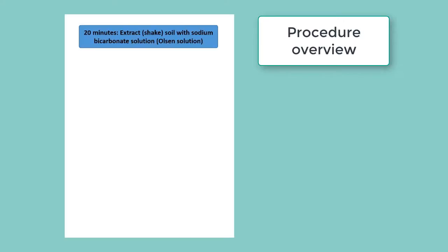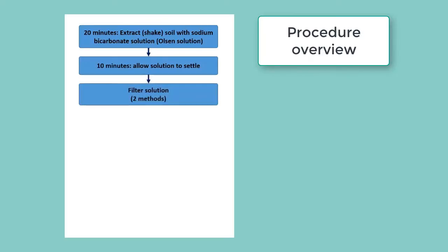Then we allow that solution to settle for 10 minutes so that some of the clays settle out to prepare it for filtration. Then we filter the solution — there are two methods for that — which gets rid of the rest of the clays in the solution, making it a clear solution.